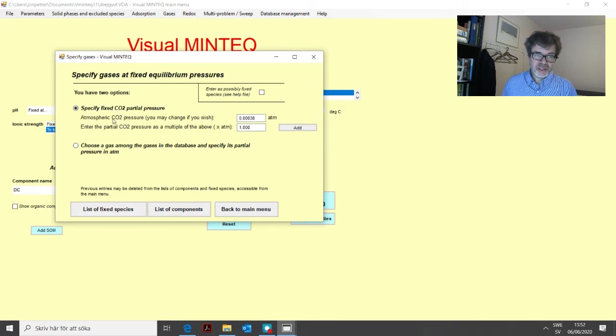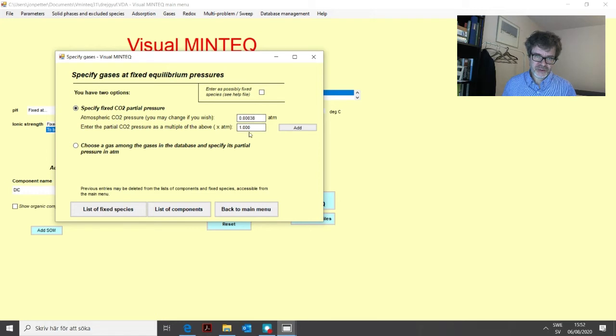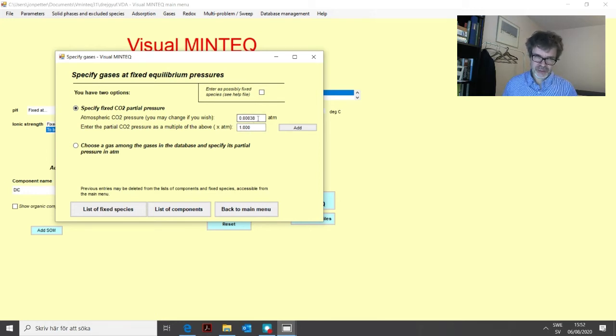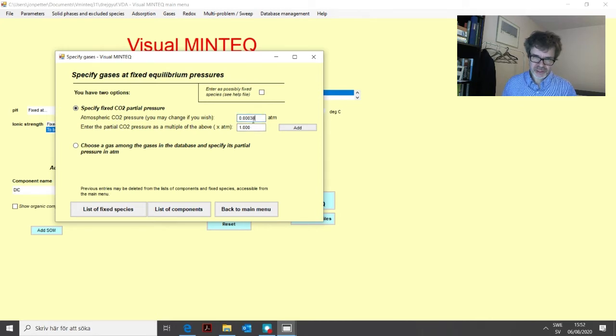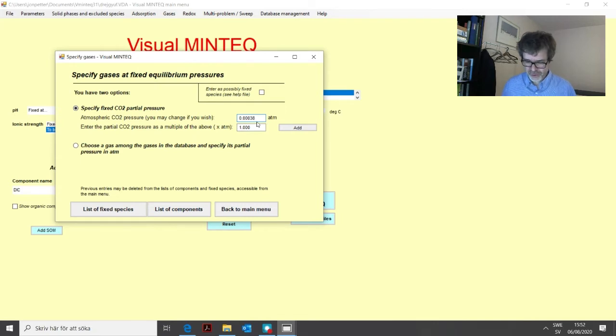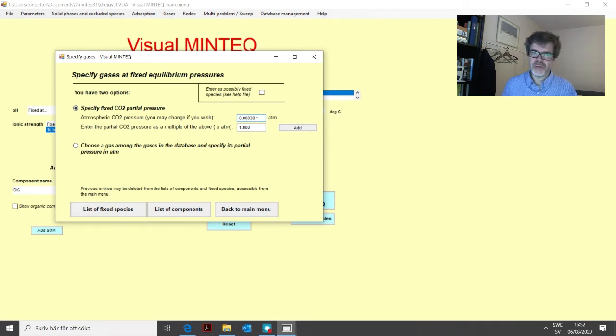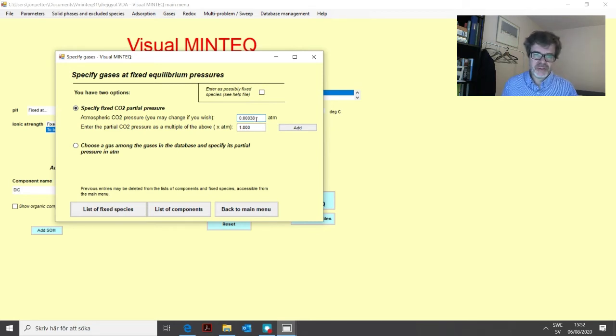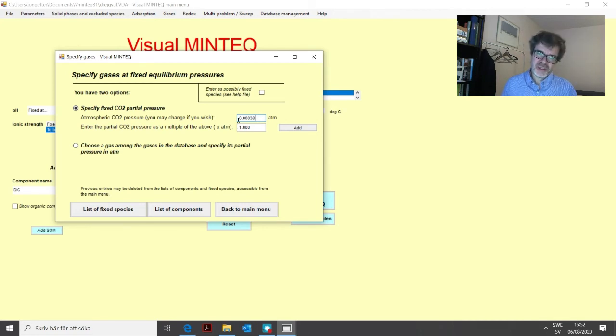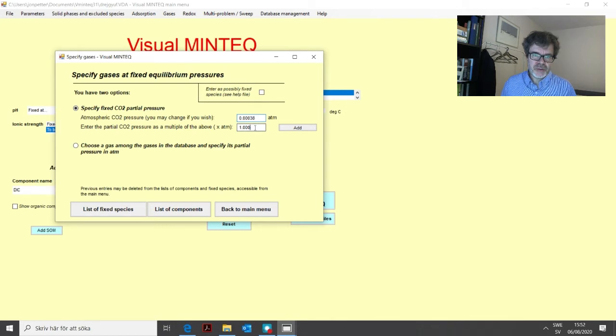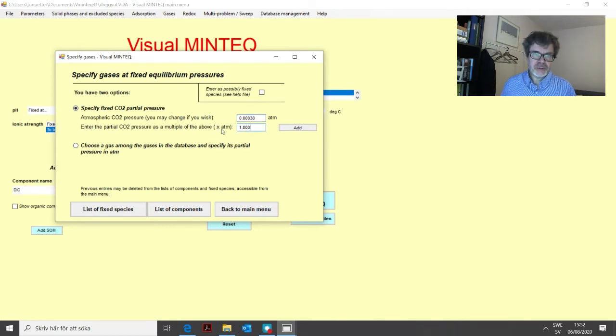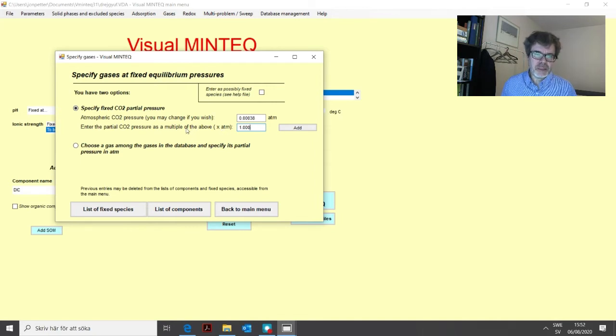So then you need to go into this gases menu, and you specify a gas. The default alternative is actually CO2. And this consists of two different text boxes. The first text box here, you have the atmospheric CO2 pressure. And this value here, 3.8 times 10 to the minus 4 atmospheres, that was approximately the value 15 years ago. And now it's higher as you might know, I think it's 4.1 or 4.2 times 10 to the minus 4 atmospheres. But we can leave it at this at the moment.